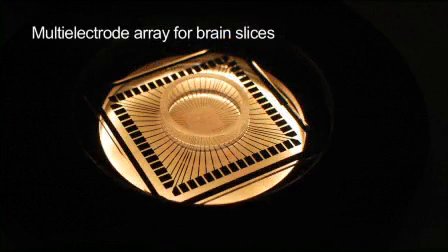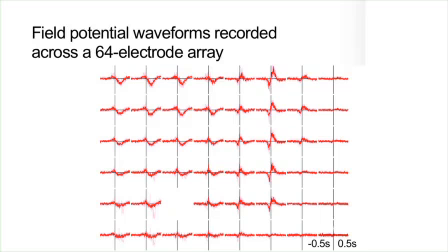Highly synchronised activity has been measured from local networks using field electrodes or multi-electrode arrays. These enable high temporal sampling rates but give lower spatial resolution due to the integrated readout of cell activity.